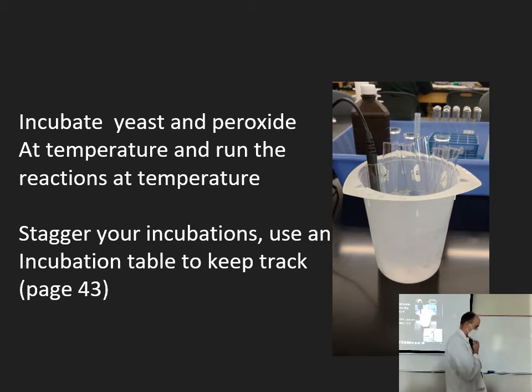Okay, so you're going to have cold temperatures and hot temperatures and room temperatures, right? To get things cold, you can't use a heat block. Like you can't use an oven to refrigerate something. I've had students try that. It doesn't work. We have ice in the back of the room in that white cooler. You can make an ice bath.